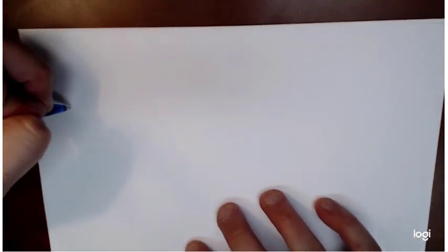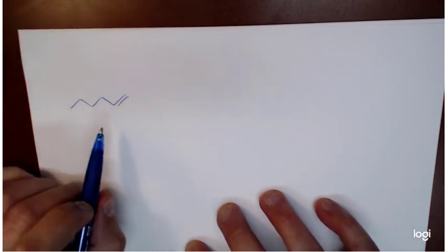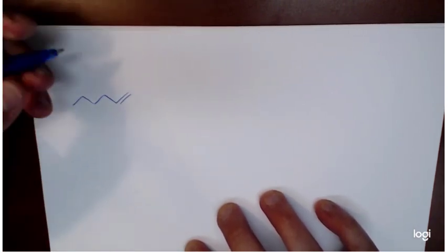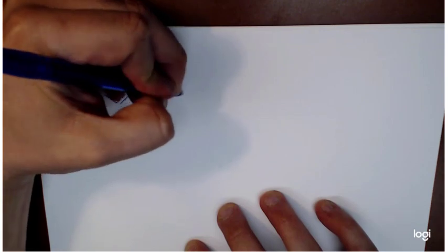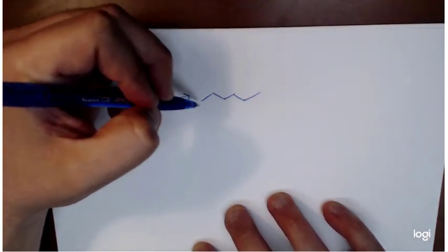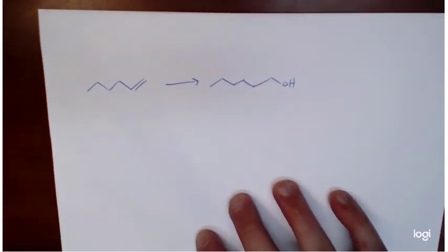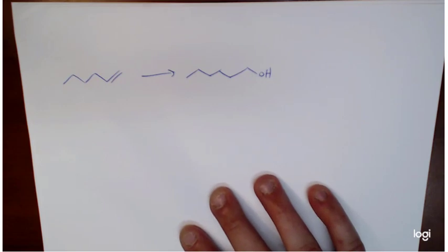So firstly, for this reaction, we are looking at reacting 1-hexene, an alkene, with sodium borohydride to produce an alcohol. And our specific alcohol we're hoping to make is this one right here. And so what we see, this is an addition reaction. In particular, this is a specific type of addition reaction.